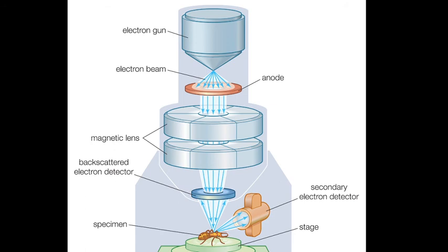So at each point on the specimen, the incident electron beam loses some energy, and that lost energy is converted into other forms of signals, and from those signals we will get information about a sample, including external morphology, chemical composition, etc. of the molecule.